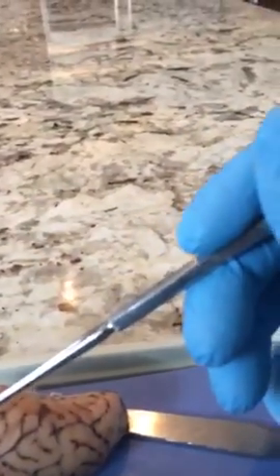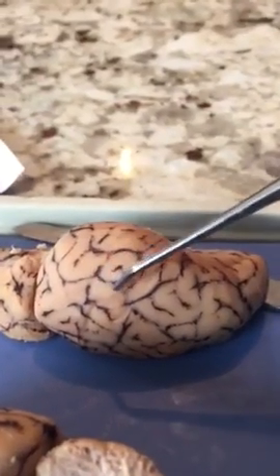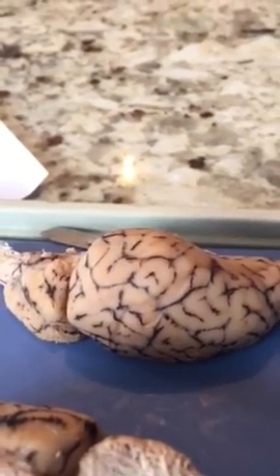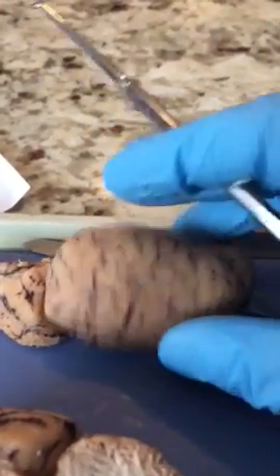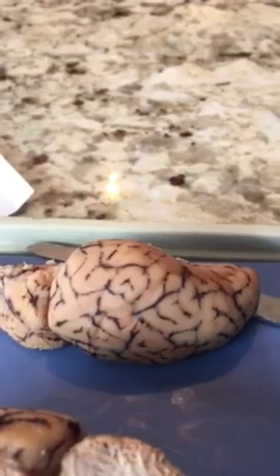So we're going to start with the cerebrum. We did the sulcus, and the gyrus, and obviously we cut through the longitudinal cerebral fissure.